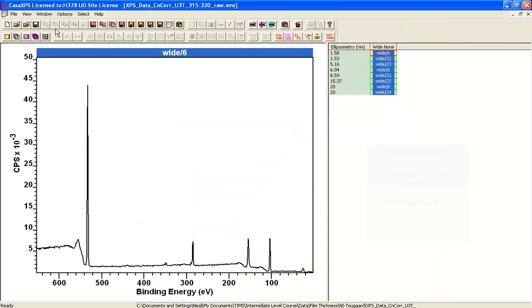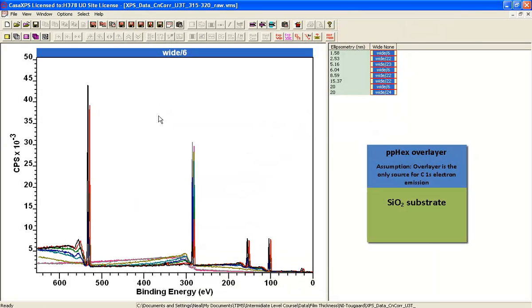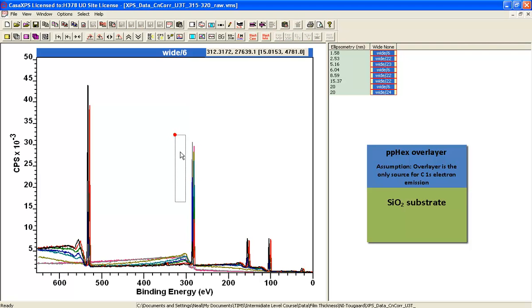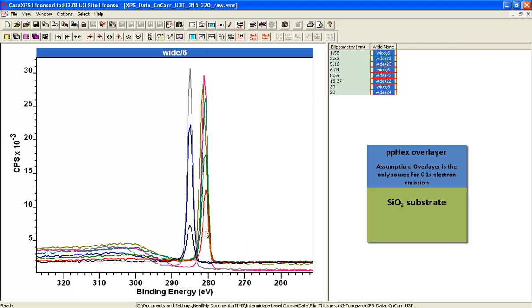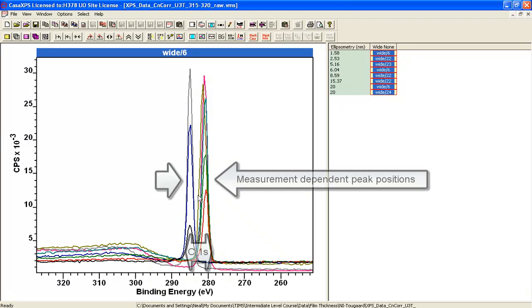These spectra are measured from different film thicknesses of PP hex on silicon dioxide. These are separate measurements, so as you might expect, the energy calibration is not perfect.